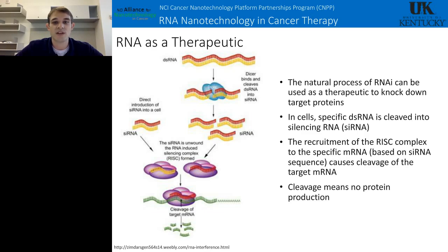And because this is RNA, we retain a quite big advantage by using RNA-based nanoparticles. It's easy for us to incorporate these RNAs directly into our nanoparticle. So that gives us a huge reason to develop these large-scale production techniques for RNA and RNA nanoparticles.